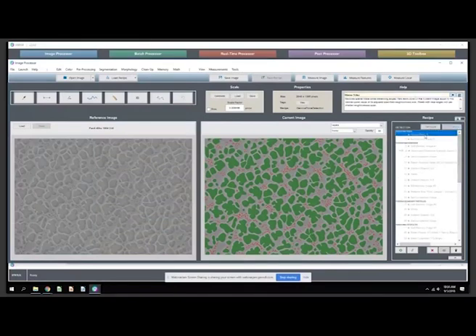All of these steps are recorded automatically as you do them from the menu bars. All the image processing functions are recorded, and they're grouped by chapter. So they give you an idea of what this section of steps do.